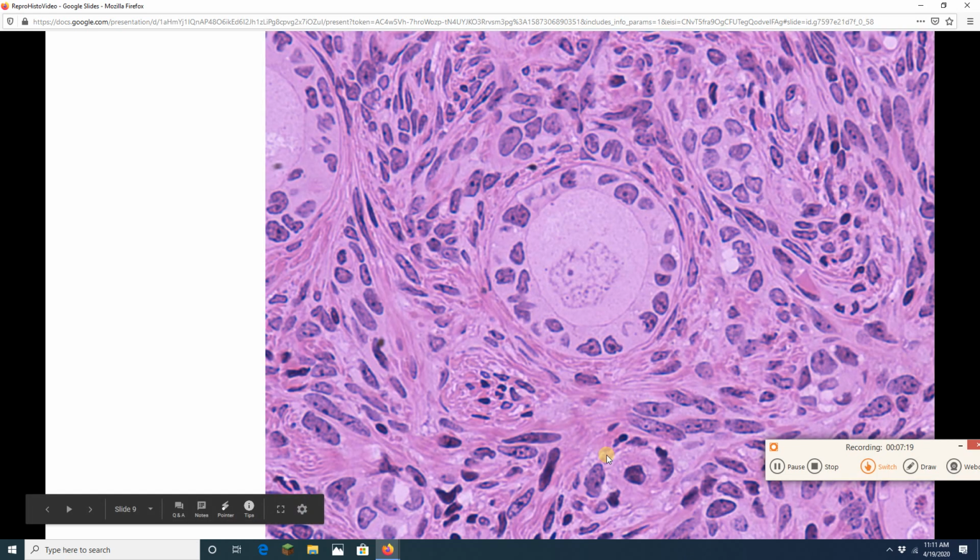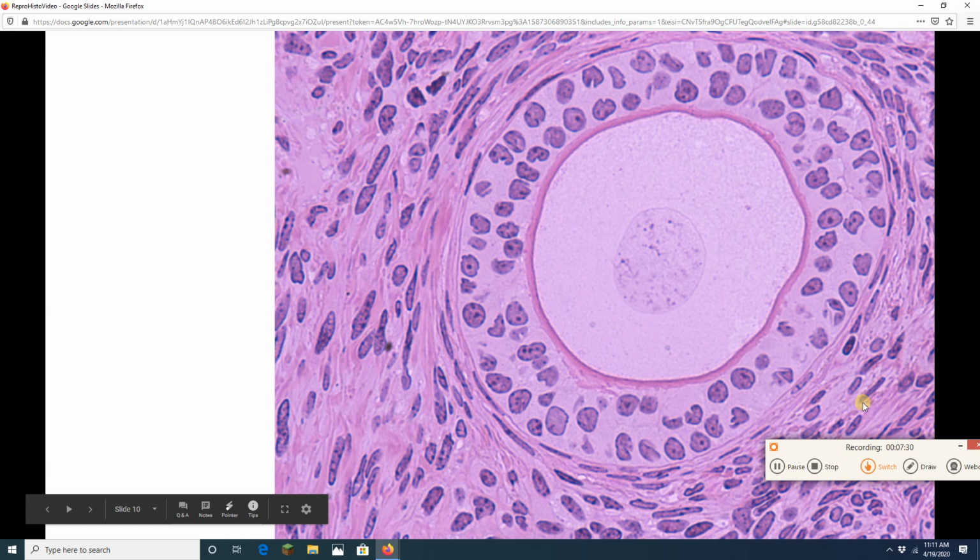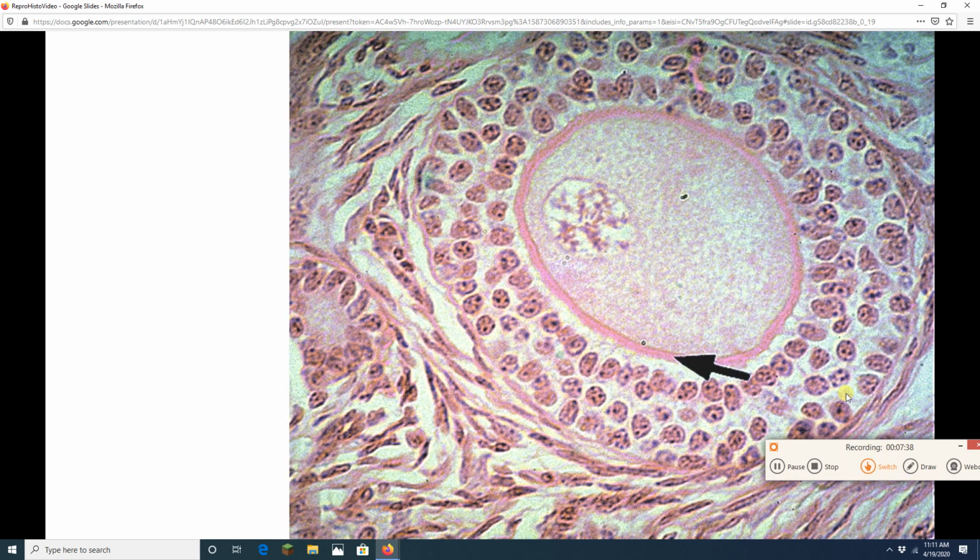Here I can see one complete, beautiful primary follicle. Pause it, find it, reach out, touch it on your computer screen. Here I can find one big, beautiful primary follicle. Again, pause it, find it, touch it. Here I have another primary follicle. See if you can find that one.